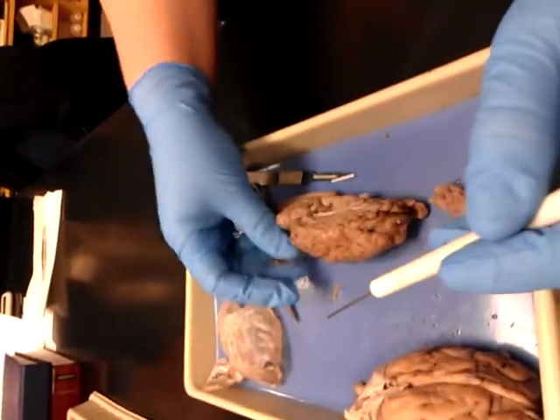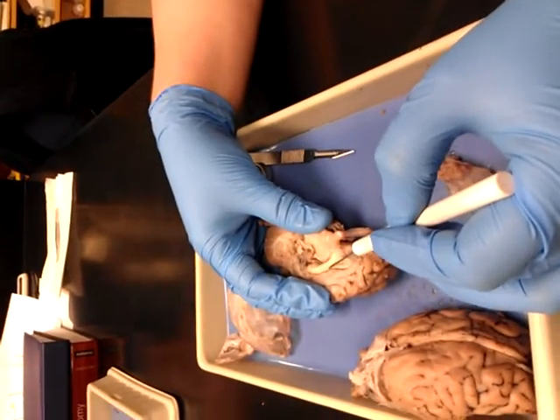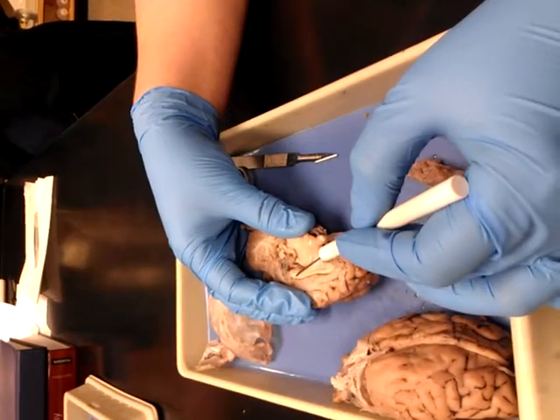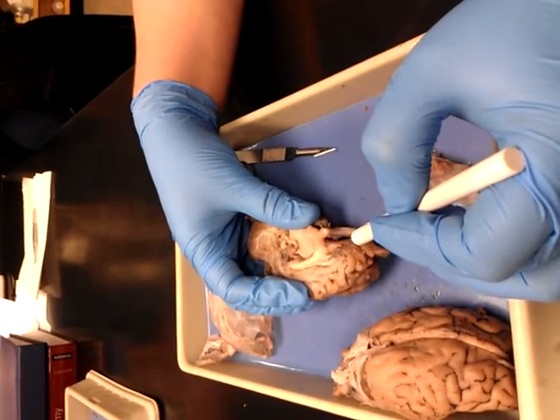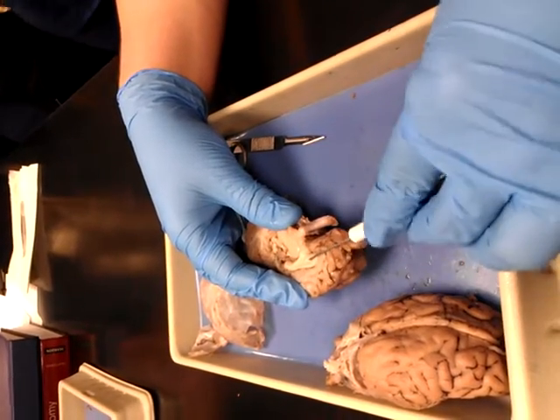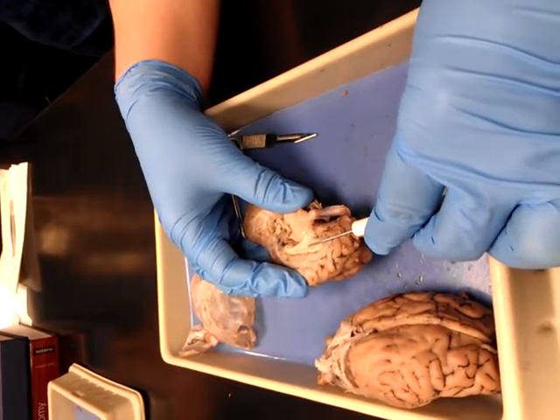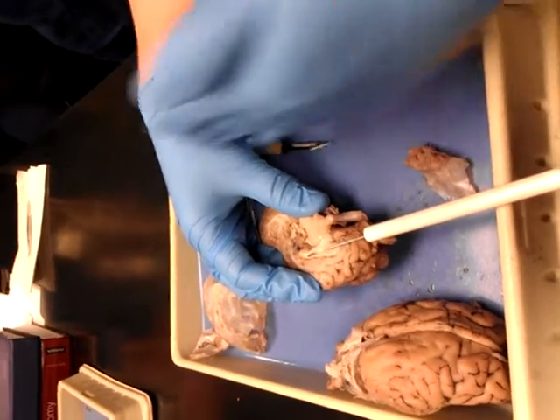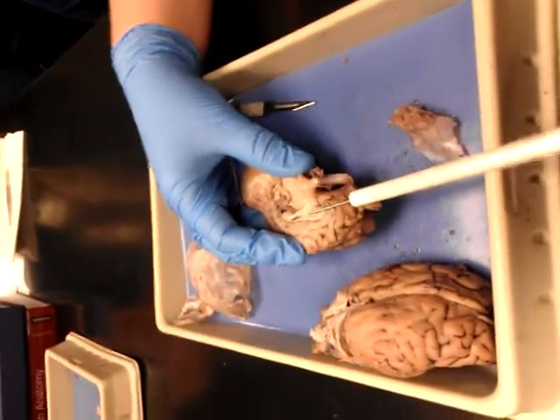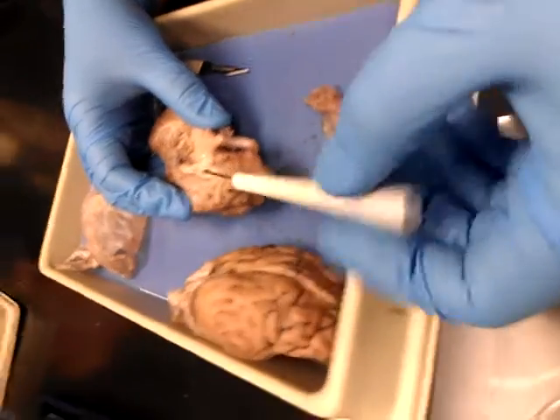Now, flip it over. See this area right up here — that's your corpus callosum. Then underneath it, see that membrane? See how it's sitting sideways? That's your septum pellucidium, the membrane there that covers the lateral ventricle. It's sitting sideways would be septum pellucidium, because it's the little membrane that covers it.